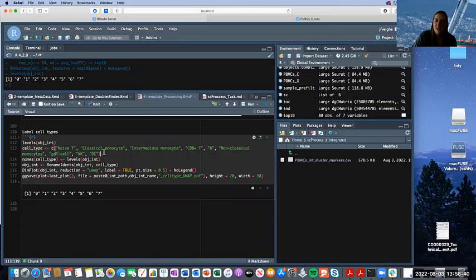It'll save the names. This won't work for me because I have more cell type names than the 8 clusters I actually have. So I'm not going to run this, but you can, and you can label all the cells. These might not be the cells you have, is what I'm trying to say, because things are going to be different for your data set and how things clustered, but it is likely. So you can go through and check which cells you have using these different plots.